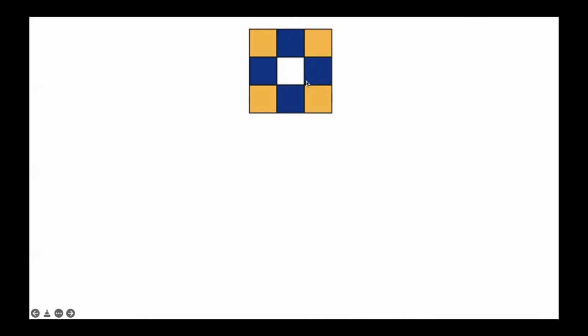And if you do not check this option, then only directly adjacent voxels will be connected and not the diagonally adjacent voxels. However, this increase range function is helpful when the image features a bad signal to noise ratio, or when cilia are incompletely labeled and contain small gaps in labeling, but it can also have the disadvantage that noise voxels can be added to cilium objects and can cause errors for the length detection.